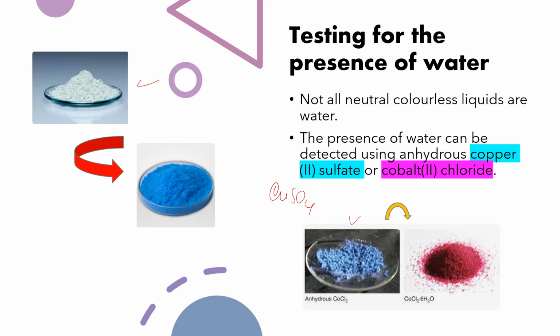When we have anhydrous CuSO4 and there is water, the water will be absorbed by the CuSO4 to form CuSO4 pentahydrate, which is blue in color.